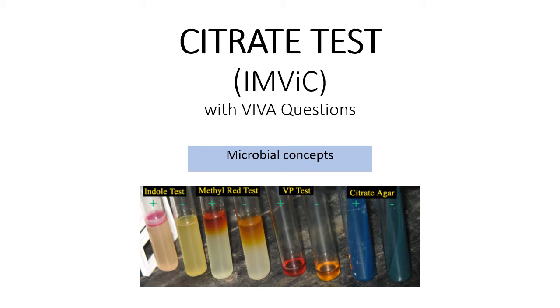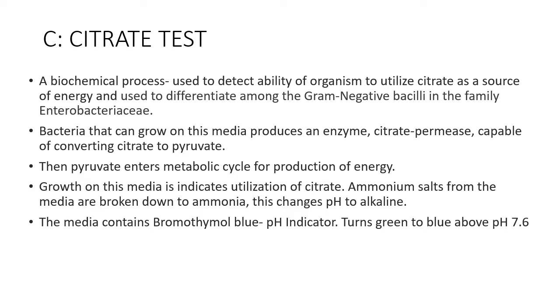So this is the fourth video on the citrate test, which is a test from the IMViC group, and in this video we will be covering a few viva questions on this test, and the principle and how the test is performed. Okay, so let's start with this. C in the IMViC stands for citrate test. Already a video is uploaded on Indole, MRVP, that is methyl red and Voges Proskauer, and this is the fourth test, which covers citrate.